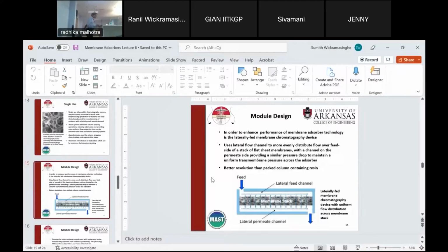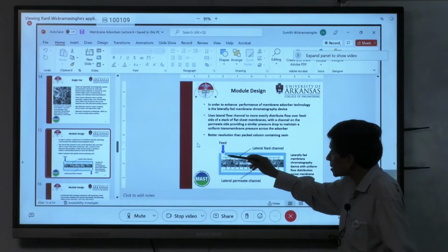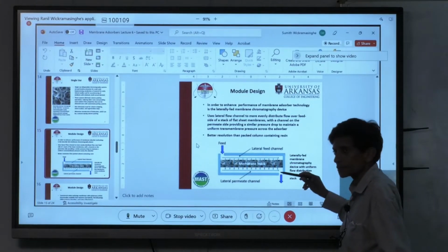Yes? Oh, sure. The lateral column, 1 second. It'll come in under pressure, yes, yes. First, when there is a high pressure there, won't the fluid directly come from there? I agree. It'll go through here, but then from here it has to go through here to come out.